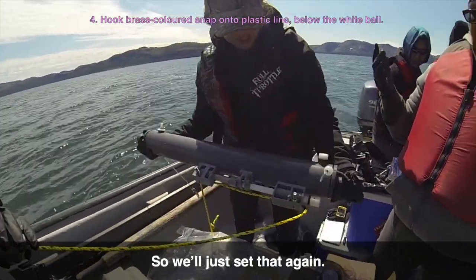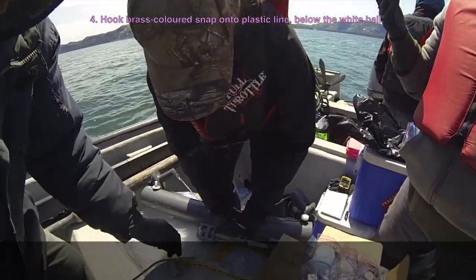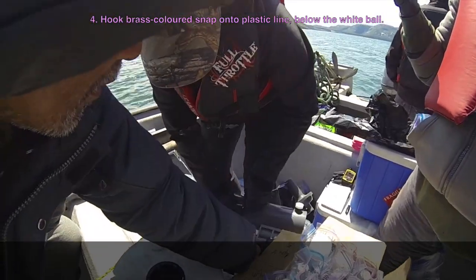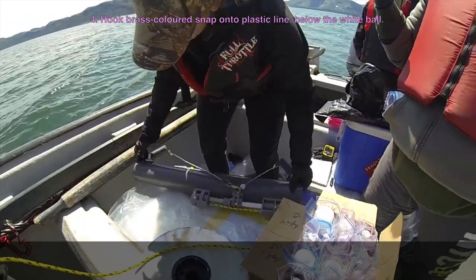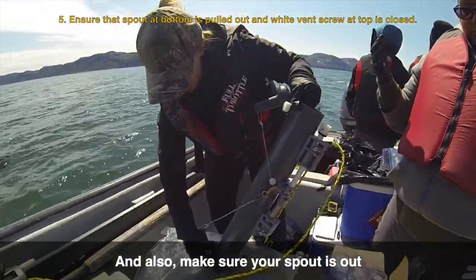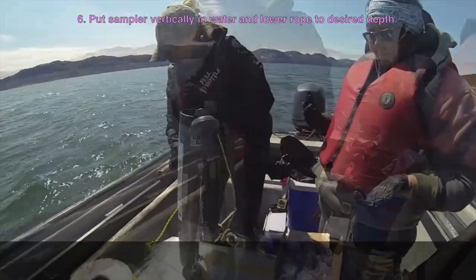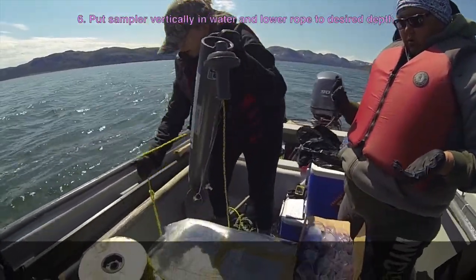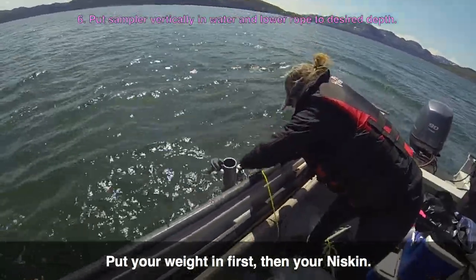So we'll just set that again. Also make sure your spout is out and this is closed so you don't lose water.